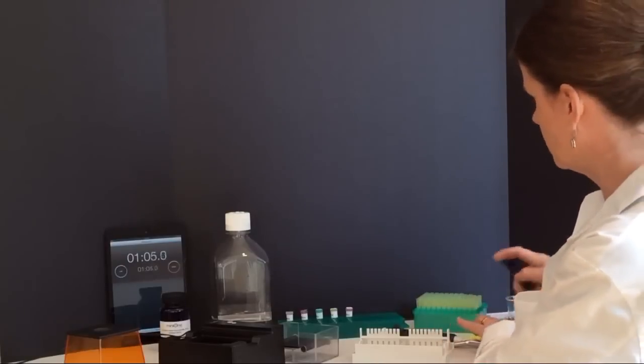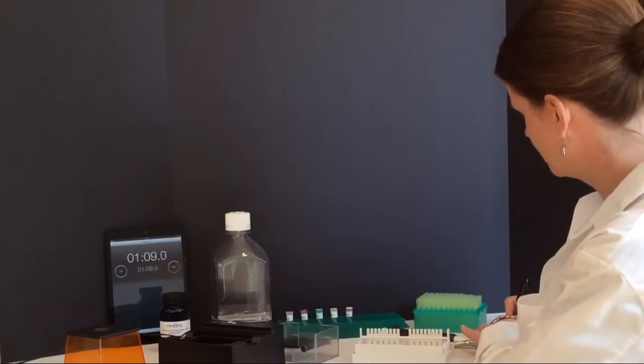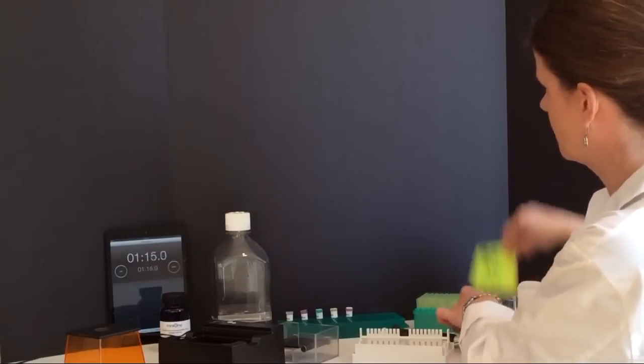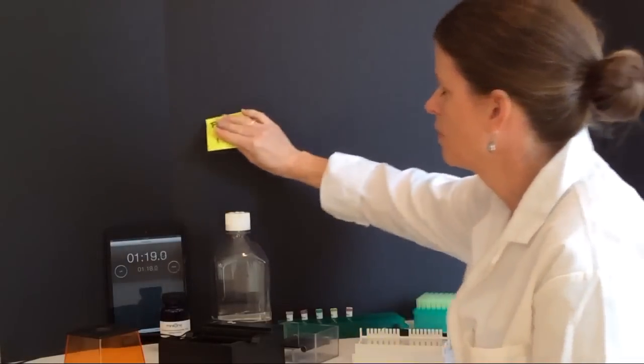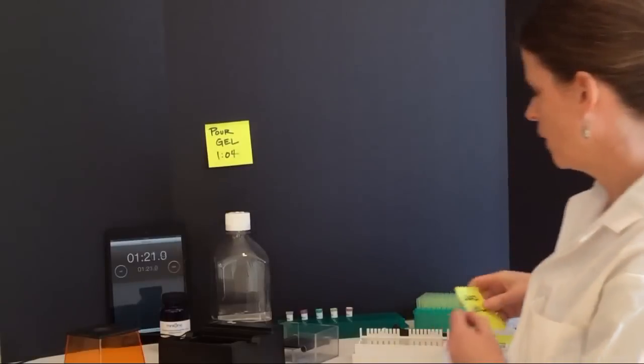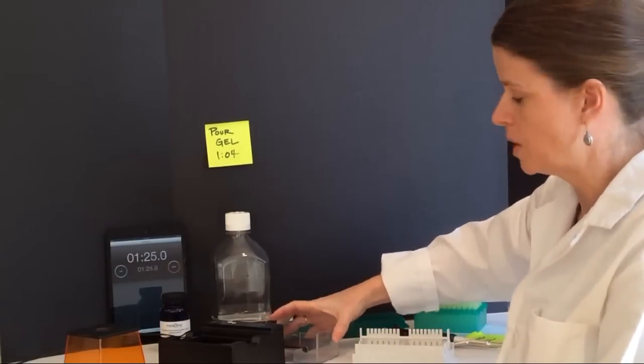I'm going to make note of our time now so we can keep track of how long this takes. While we allow our gel to solidify, I'll show you a few of the other features of the Mini One System.